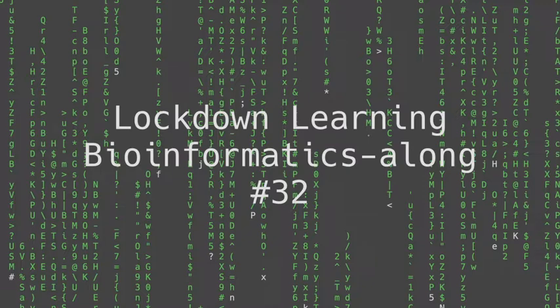If you remember yesterday's lesson, the aim was to look at PCA as much as possible. The reason for that is PCA being a very effective technique for assessing the similarity between samples in an RNA sequencing experiment or in lots of high throughput techniques.